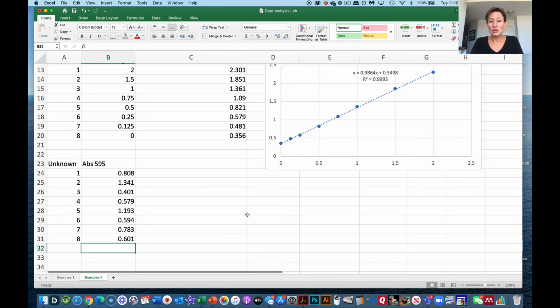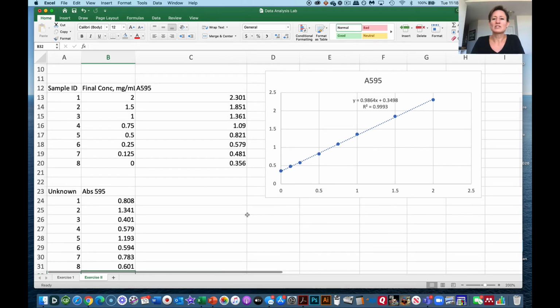So highlighting, let's look here. And I want to make sure we understand this standard curve. We started out by taking known concentrations. We measured the absorbance value. So we were kind of going in this direction with the creation of a standard curve. This was known. We measured this value, okay? And then that gave us, we measured our absorbance value. We had a whole bunch of different concentrations. Beer's law tells us that the relationship between absorbance and concentration should be a linear relationship. Okay, so that's what we have here.